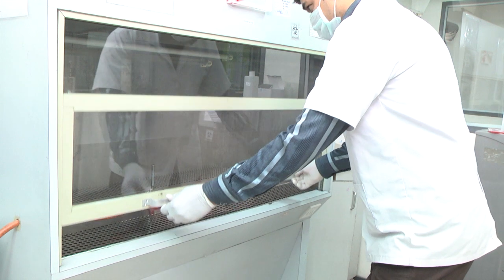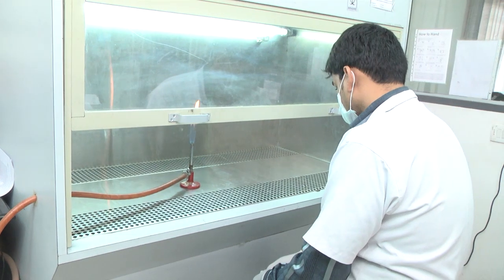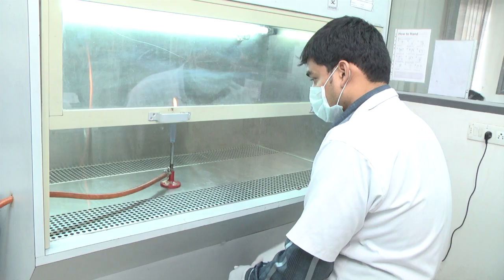Wait for 5 minutes and then open the hood. With lights on, set to work. Ensure that the exhaust is on while processing.